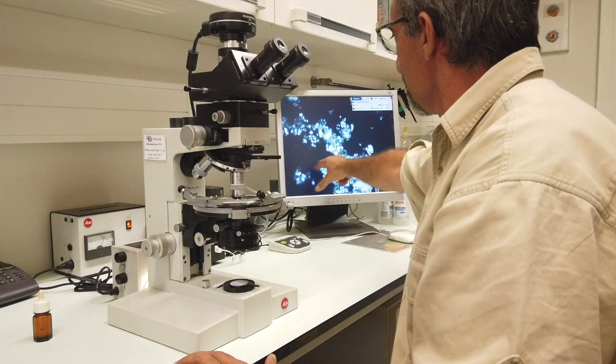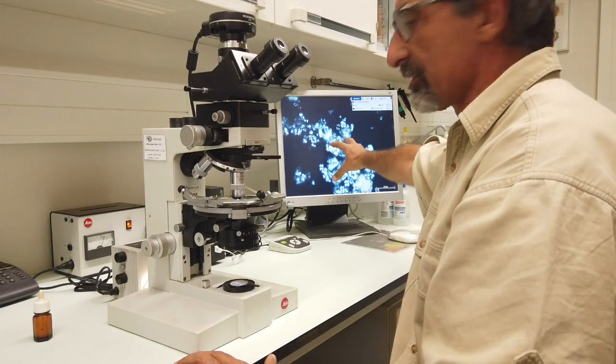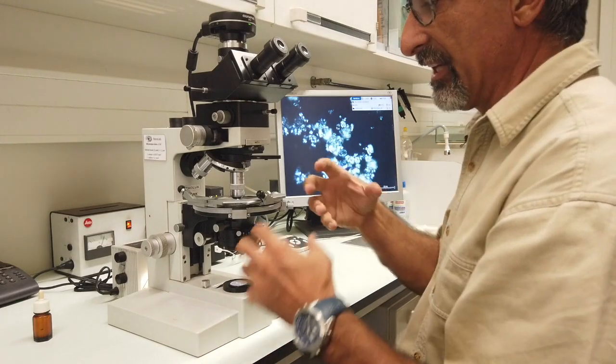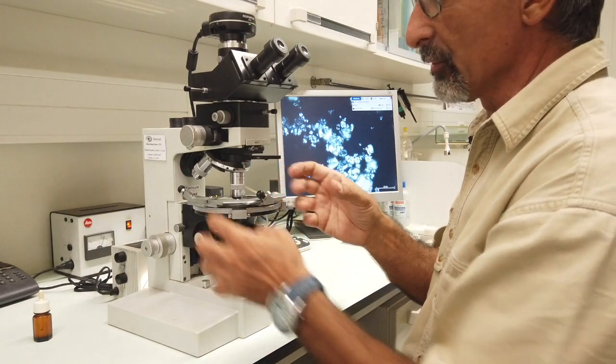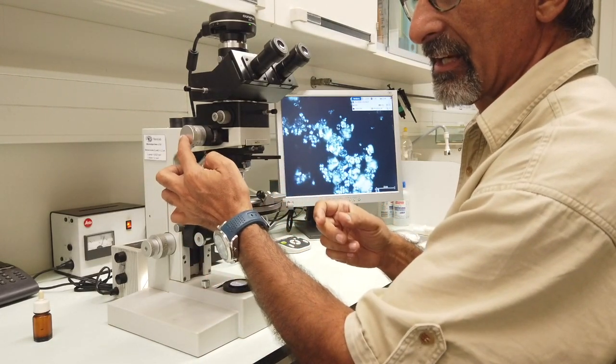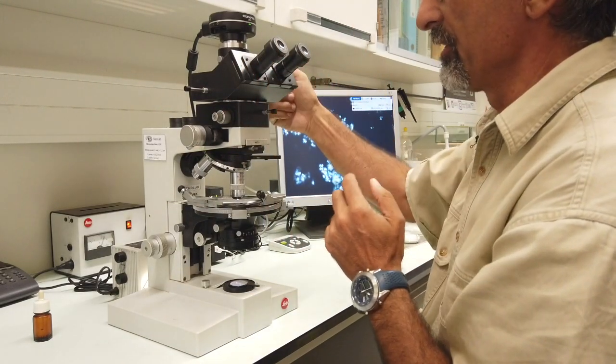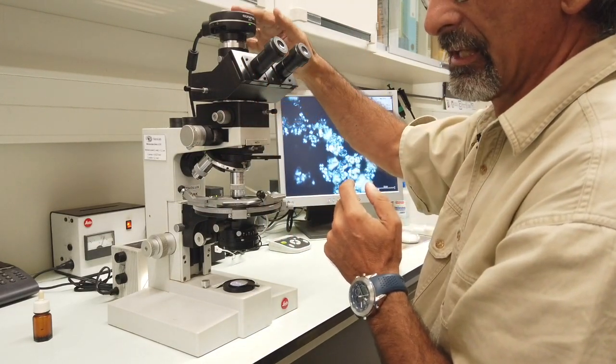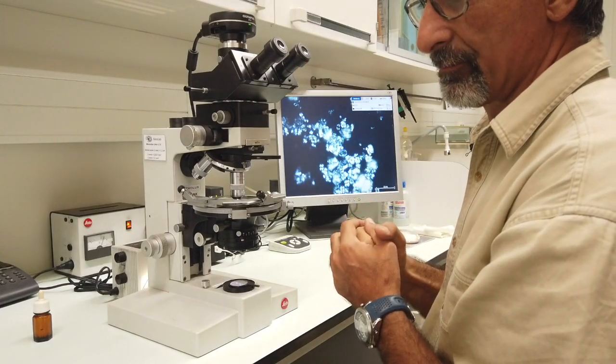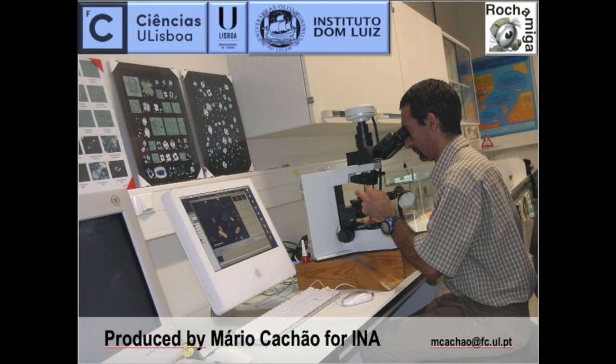Between them, there's the dark field, but they can be seen because they interfere with light, and so light can pass through the analyzer and come to the eyepiece, or in this case, to the triocular and to the digital camera. So, now we can see them all over the place.